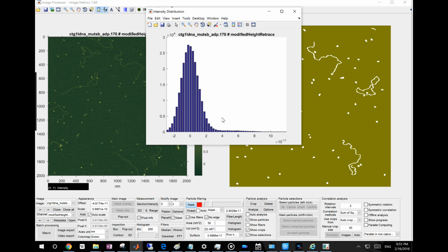This is usually the contour height of your molecules. But typically we only use the average number, which is about 0. Or you can use the peak location and use that as the height, which is pretty small. You can just leave it empty as if it's 0. So this is about the surface height.